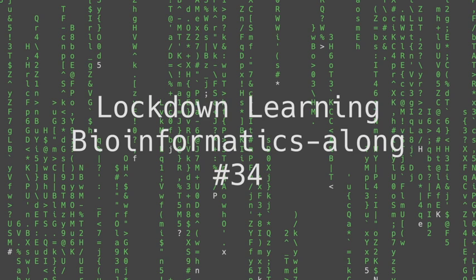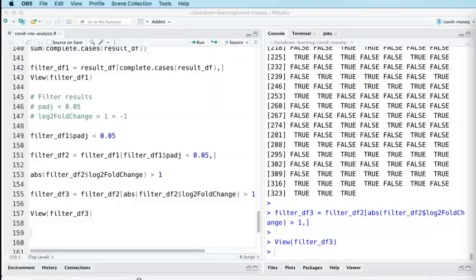And so that got us to the point yesterday, here we are, where we had applied these successive filters to our data frame. And what I did, rather than overwrite the data frame every time, I kept making new data frames. So every time I applied a new filter, I created a new data frame.